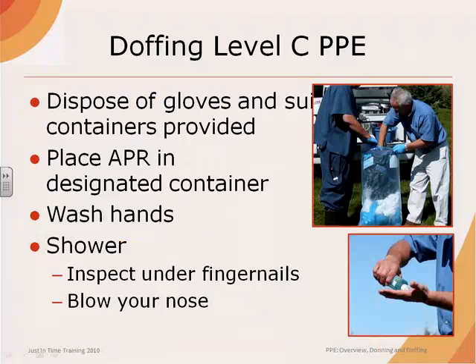After doffing all PPE, wash hands thoroughly. Take a complete shower and change to clean clothes. Inspect under fingernails and blow your nose to clear your respiratory passages. This should be done immediately after leaving the infected or exposed area and before visiting public places.